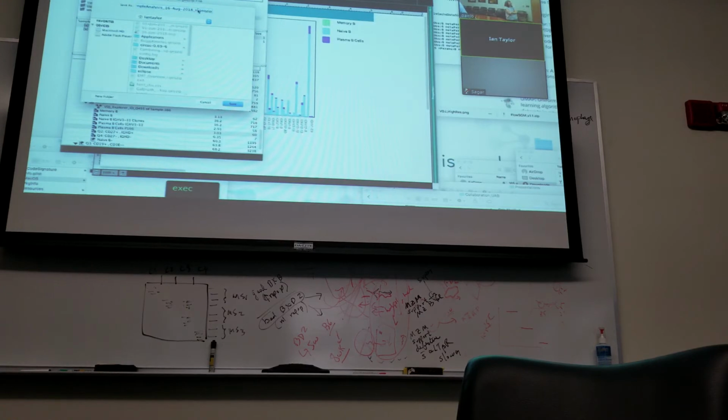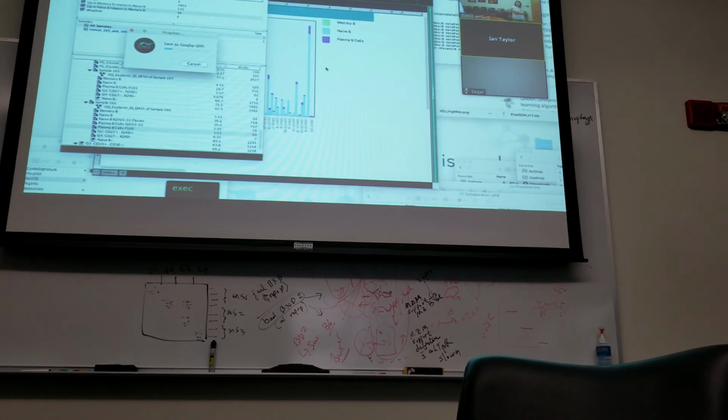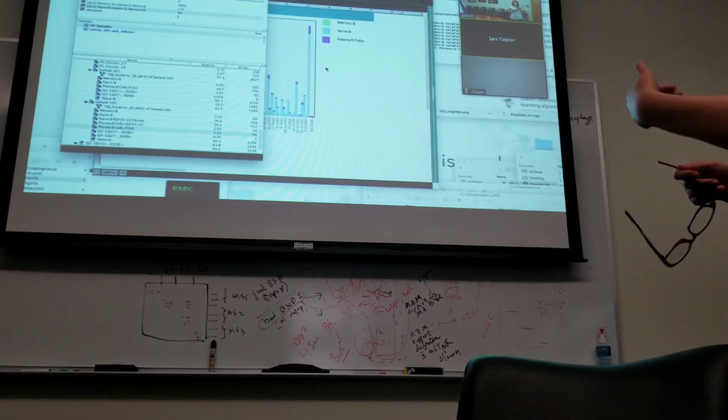One thing, Ian, since this is such a burning question, we actually have sequences. I just found out they finally got around to sequencing naive and plasmablast. Transitional, yes, even earlier. We have the sequence for those for two patients, two subjects. So we sorted, and so we won't have to have hazy gating. That would allow us to compare this.